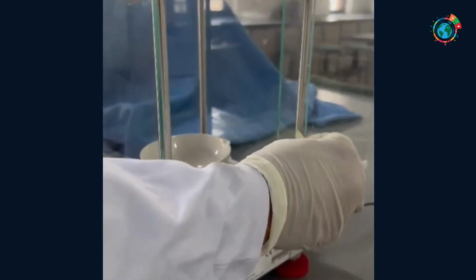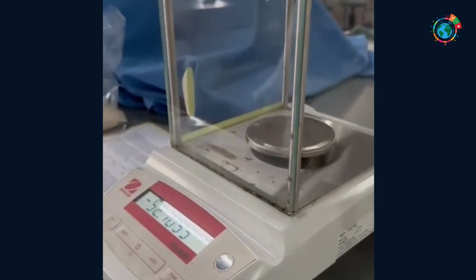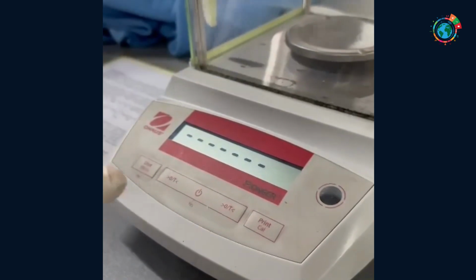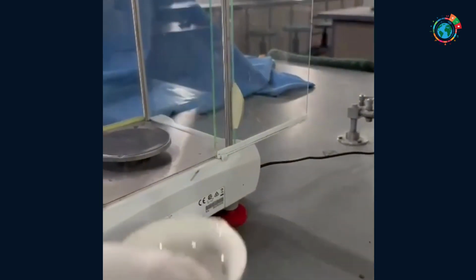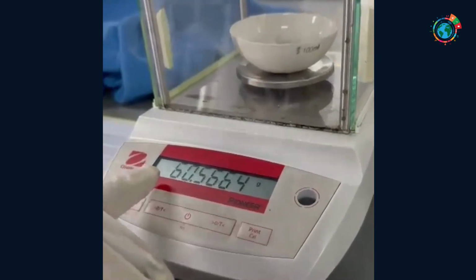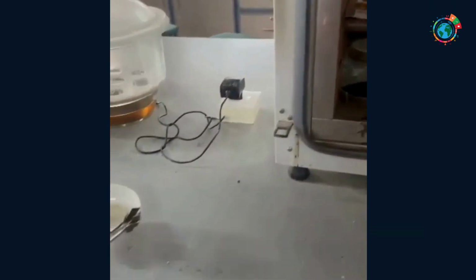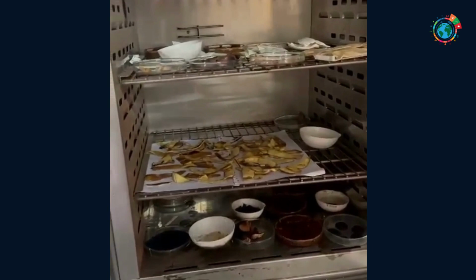content. After noting the weight of the sample before drying, take the sample-containing china dish out of the glass windshield area of the weighing balance and use the tare button to reset the balance to 0. Again, place the china dish containing the oat flour sample on the weighing pan of the balance and close the sliding glass door. Note this reading as the weight of the sample plus the china dish before the drying. Let's now begin with the drying procedure. For this, place the sample-containing china dish in the hot air oven and close the lid.